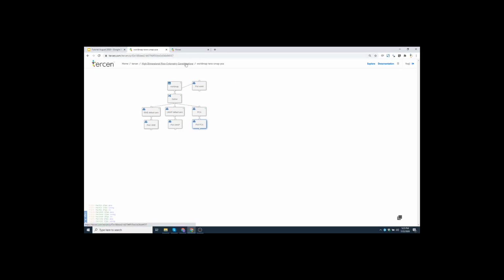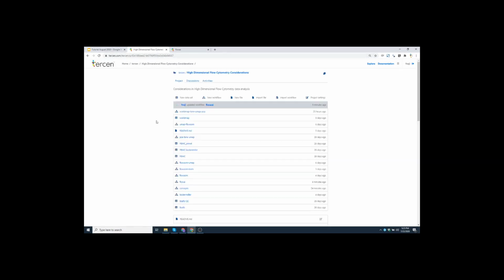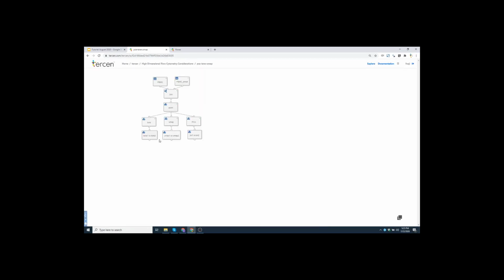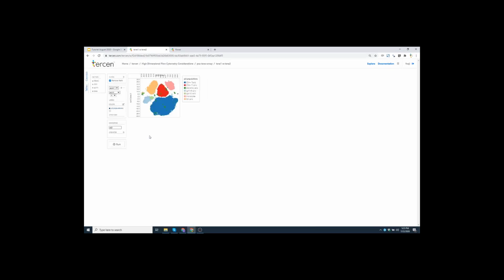And if you want to see it applied, I took the PBMC data set from Kirsten Diggins because it has different population groups. Let me just look at the workflow that has that. It's basically the 3 algorithms. Here it is. This data set has different cell populations, and you can see how tSNE looks.